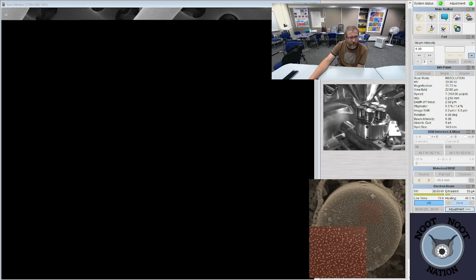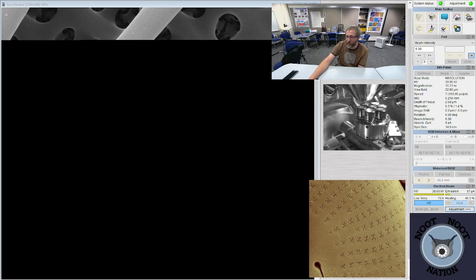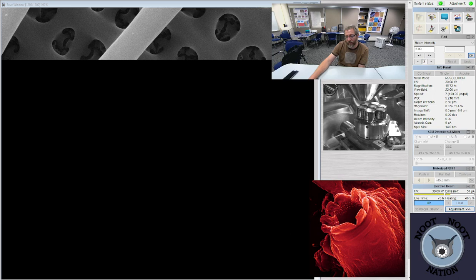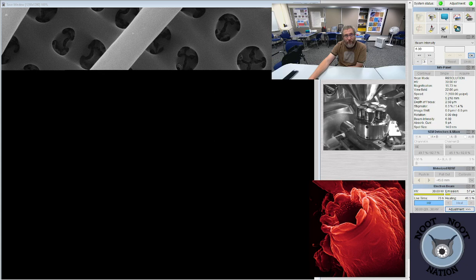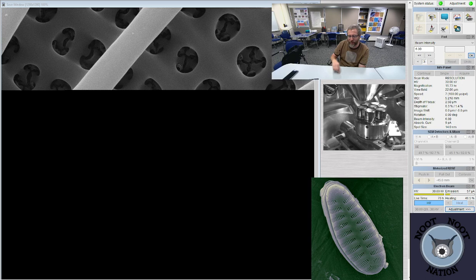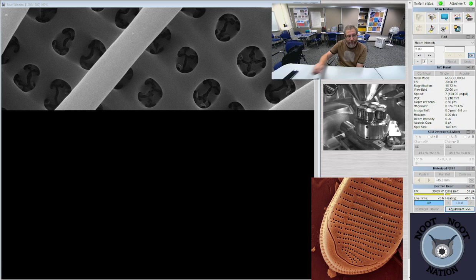Do you age ancient diatom samples from the diatoms themselves or from the surrounding material? The surrounding material, Sam. Well, let me rephrase that. Usually the surrounding material. Typically you can't determine the age of something from the diatoms. We can't date the diatom material. But in some parts of the world where diatoms are evolving, you can actually get into looking at the biostratigraphy. Mostly it's in the marine realm. They don't really have that for freshwater stuff very much. But you can figure out the age of marine samples based on when a diatom evolved into being or when they went extinct. That's pretty common.